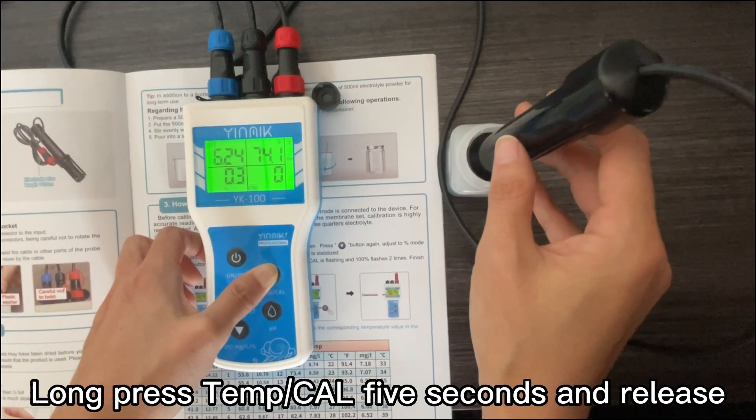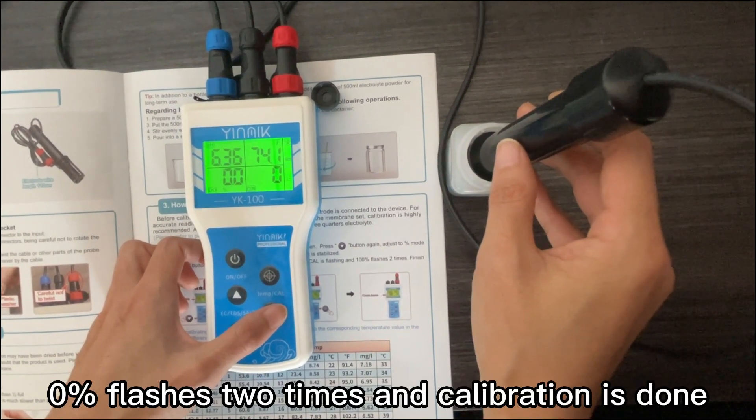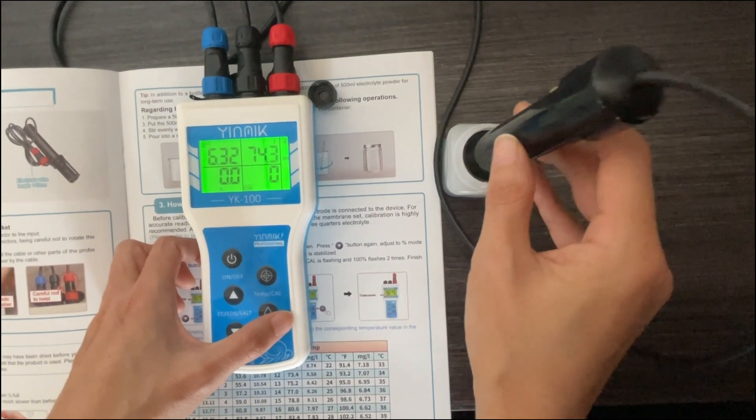Long press Temp/CAL five seconds and release. Cal is flashing. Zero flashes two times and calibration is done.